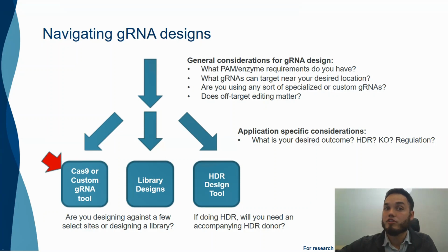First, we'll just discuss the basics of how tools through the IDT portal can be used to perform both standard and custom guide RNA design and synthesis.